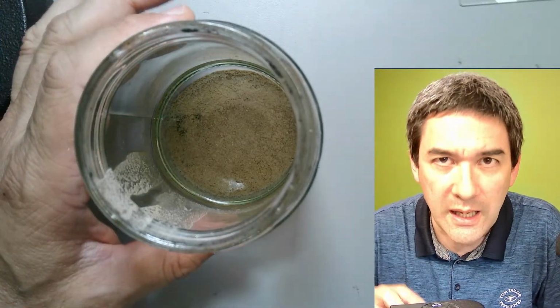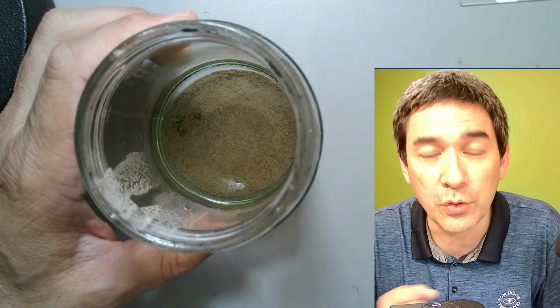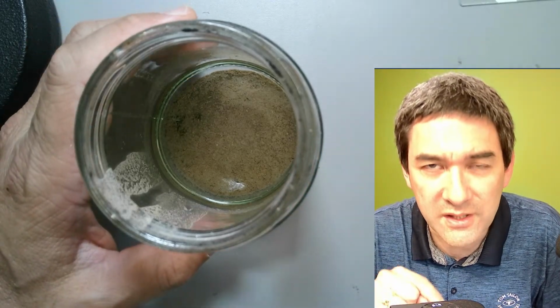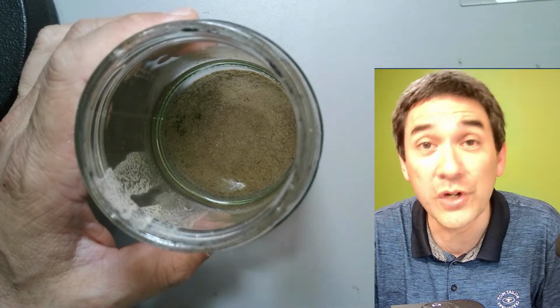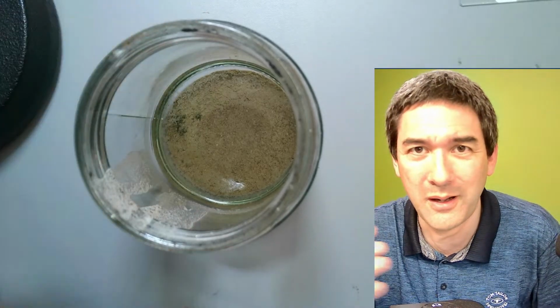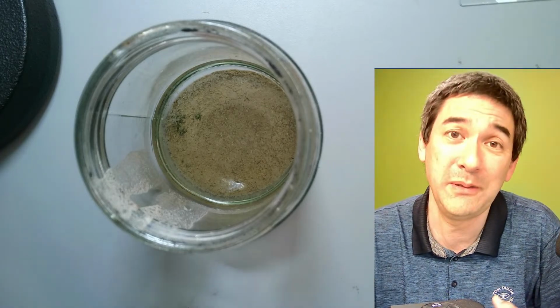First of all, originally I kept the jar open. This causes, of course, water to evaporate, but that's a problem because if the water evaporates and this is salt water, then the salt water concentration goes up. You do not want the salt water concentration to go up above a certain critical level. So what I've done is I added a little bit of tap water.